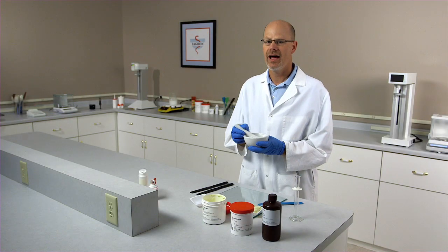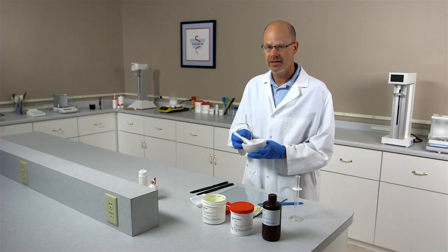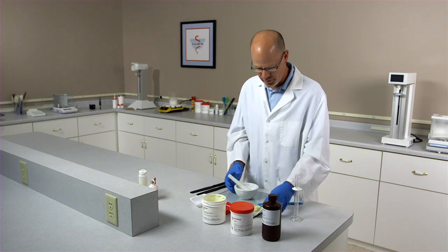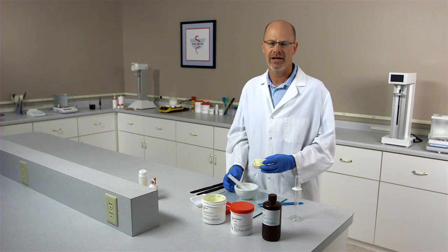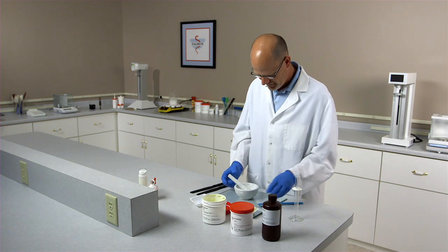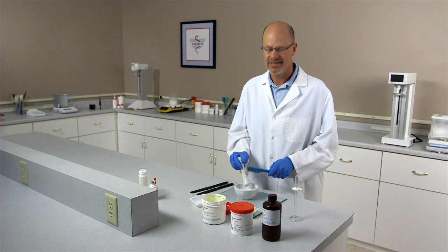Once you get a non-gritty, homogenous paste, you can add the Pentravan — which we've pre-weighed — into this preparation using geometric dilution. To do this, we'll use the ointment slab.